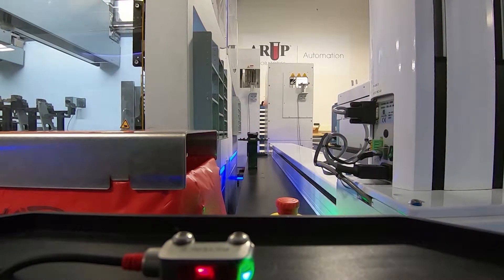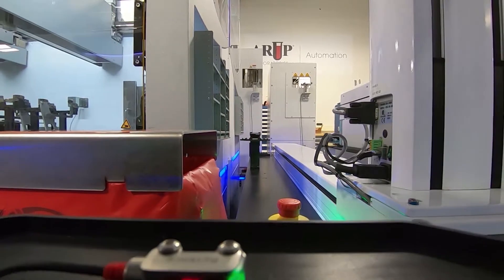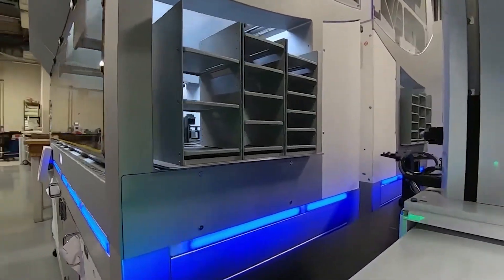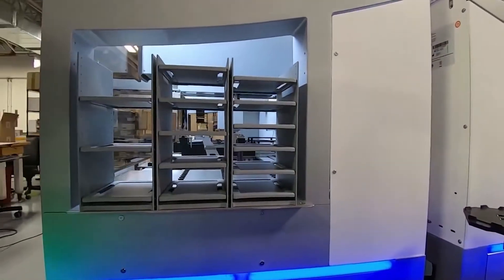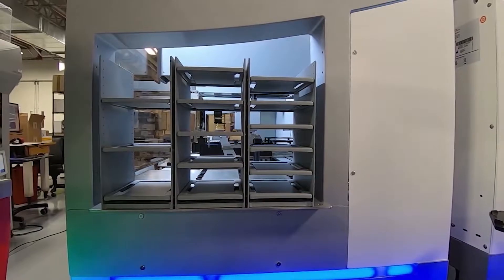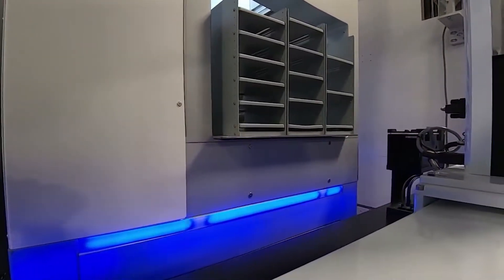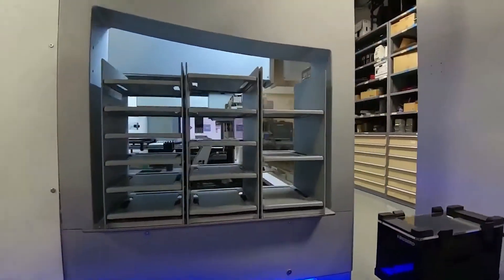Moving to our other precise arm, we have another handoff nest. You'll notice there are biohazard bins on the system itself — that's because as reagents expire or are used, the system audits and disposes of them rather than leaving them online. We also have two Tecan 1080s again, three-arm systems.